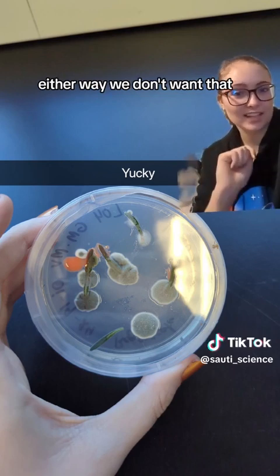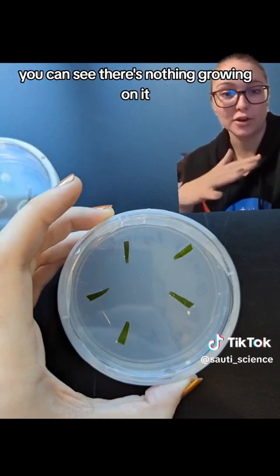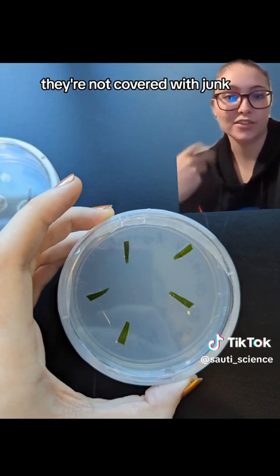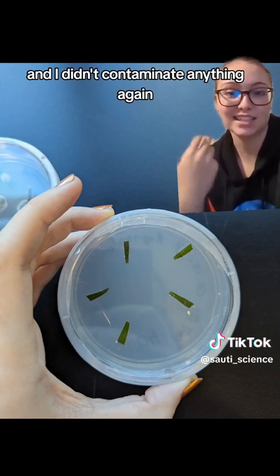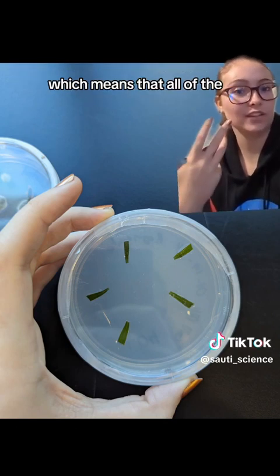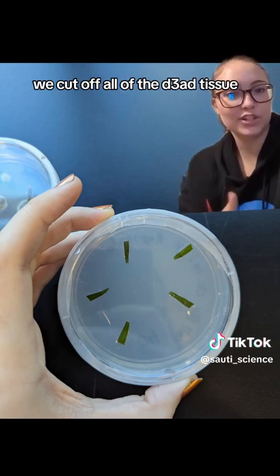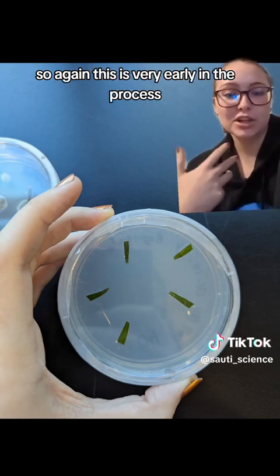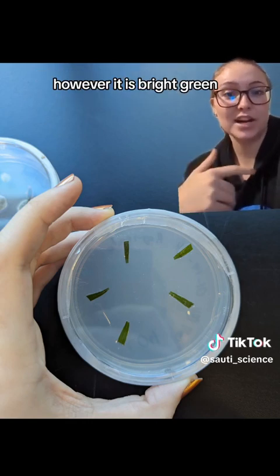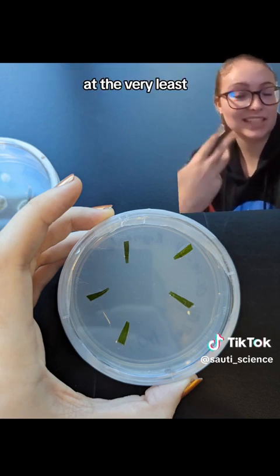We don't want any of that in anything other than the negative control. Here's one of the positive experimental ones — you can see there's nothing growing on it except for the five leaf samples, which we want. They're all nice and green, not covered with junk, meaning the sterilization was good. You can also see these leaves are bright green and healthy, meaning all the tissue killed by the bleach solution was cut off successfully. The regeneration media is at the very least keeping it alive.